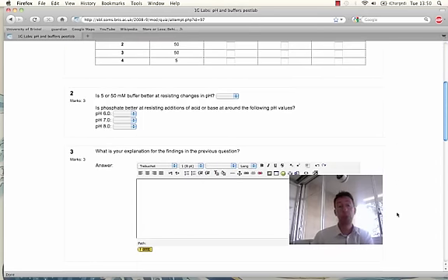So you see, wherever possible, we've tried to automate this marking, but in some cases, such as when the student puts in free text answers, that obviously has to be marked by hand. Nevertheless, this system has eliminated this huge paper trail of 20,000 bits of paper flying backwards and forwards each year, just in our building, and it has increased the amount of feedback that the student can get.